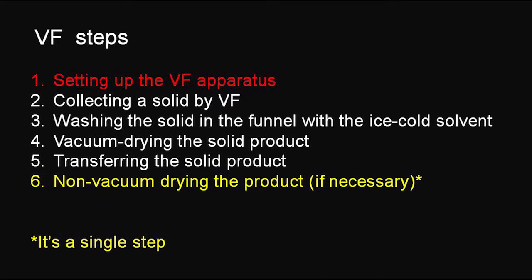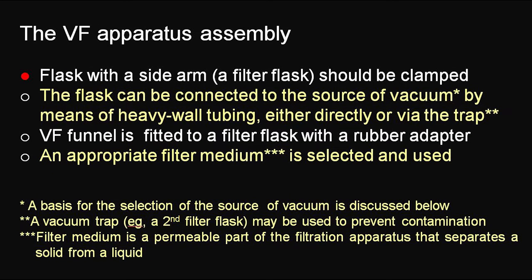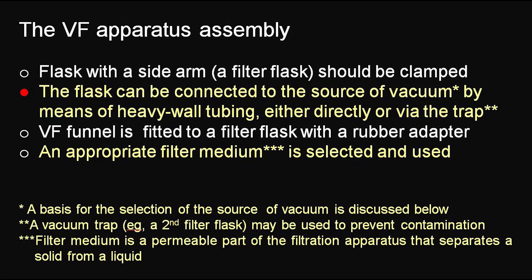The important thing to remember about the vacuum filtration apparatus assembly is to make sure the filter flask is clamped securely before connecting its side arm to the source of vacuum by means of heavy-wall tubing. This can be done either directly or indirectly via a vacuum trap. The trap — for example, a second filter flask — may be used to prevent contamination due to back suction.